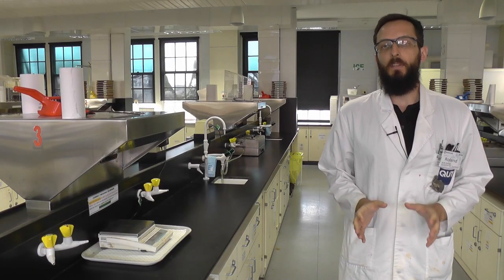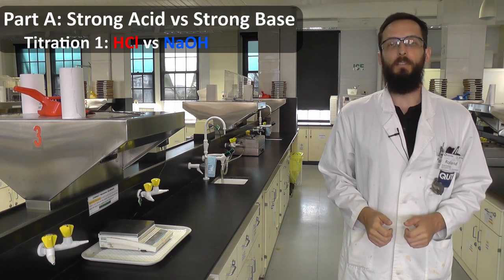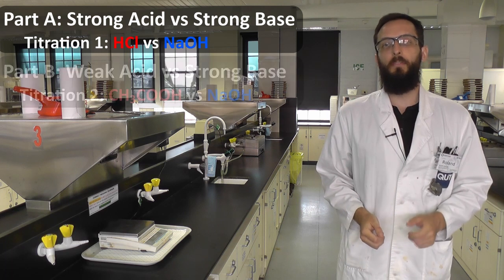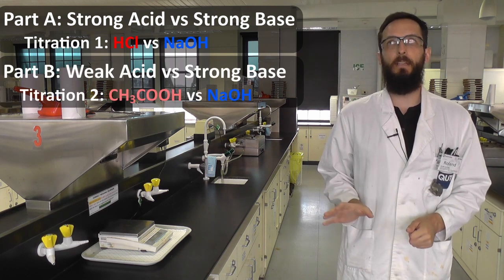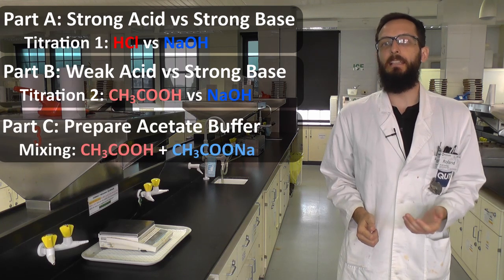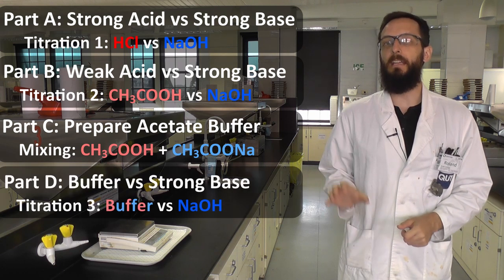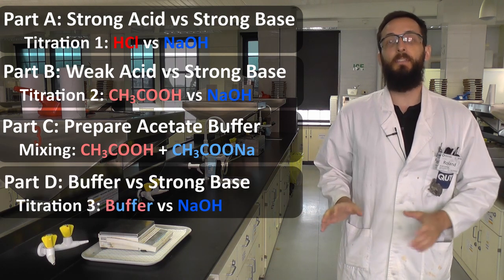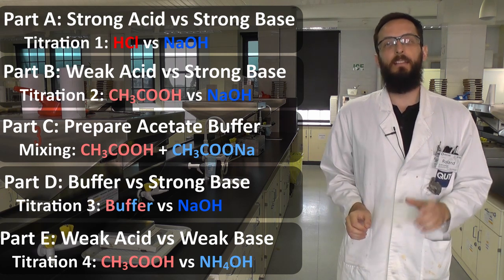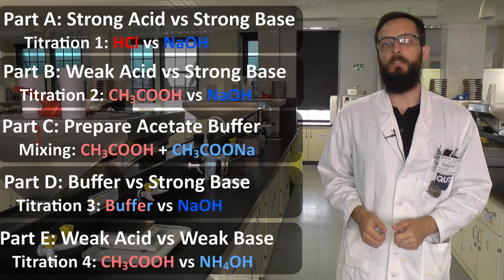To give you a brief overview of this experiment, you're going to complete 4 titrations in total. The first, you'll titrate a strong acid against a strong base, that's hydrochloric acid and sodium hydroxide. Then you'll titrate a weak acid against a strong base, acetic acid versus sodium hydroxide. Then you'll prepare in part C an acetate buffer. In part D, you'll use that buffer and titrate it against the strong base of sodium hydroxide. Then in part E, you'll titrate a weak acid against a weak base, that's acetic acid versus ammonium hydroxide, and compare the curves of each titration.